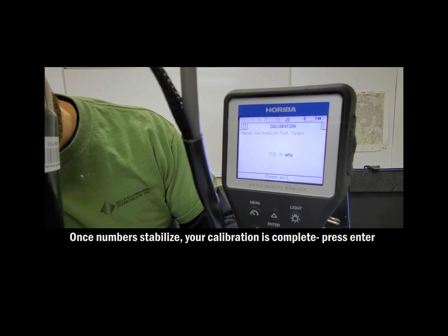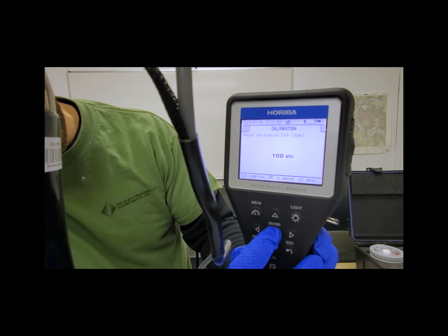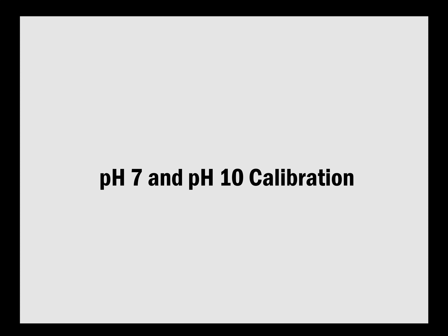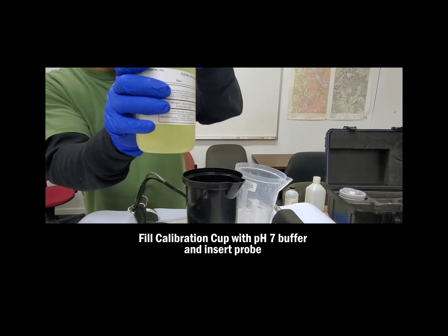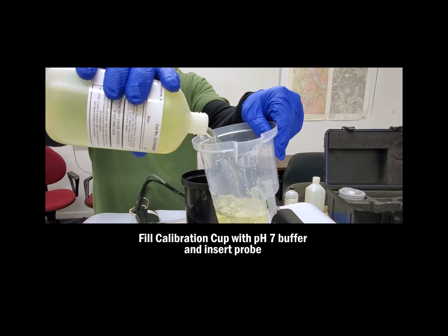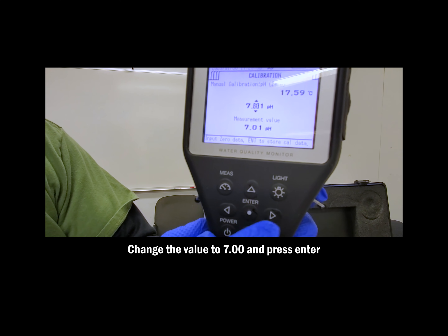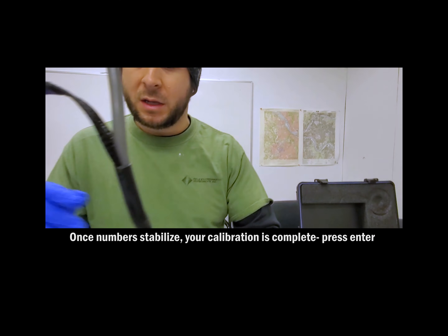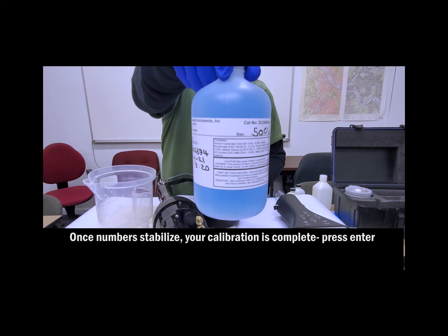In the next step, we'll calibrate the pH 7 buffer. Pour the correct solution into the cup and insert the probe. Choose a manual two-point calibration for pH and make the first value 7 and calibrate. Once the number is stabilized, your calibration is complete. Press ENTER and dump out that solution.